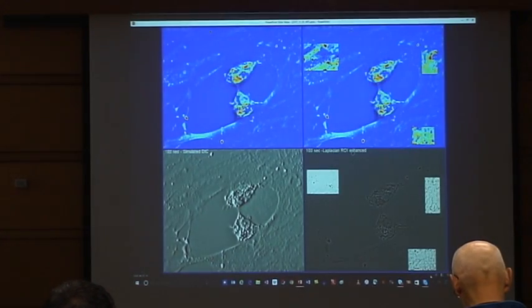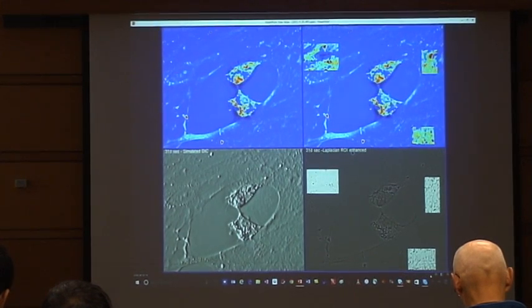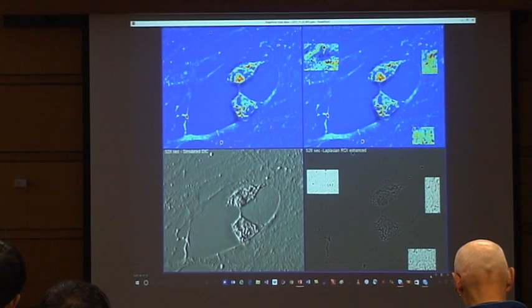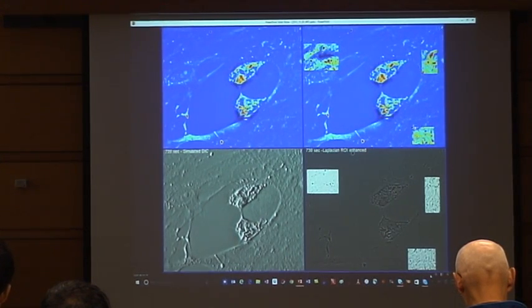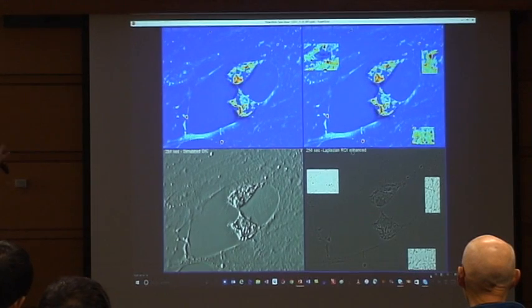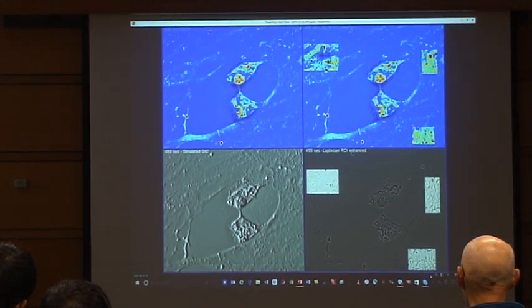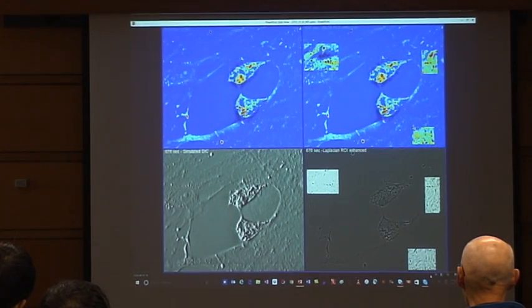Now, what I want to talk to you about today is something else. We put a lot of work into getting very high resolution phase images, and then in order to measure growth, you replace all that image of the cell with one number. So it's kind of throwing away all that effort. But since we have all this information, the map is essentially a density map. This is mass moving around in space and time. We're wondering whether we would be able to understand the physics of the transport just based on this data. So it's kind of an inverse problem.